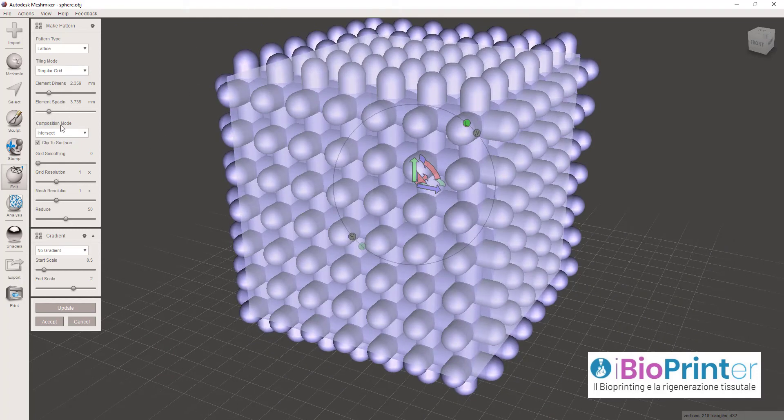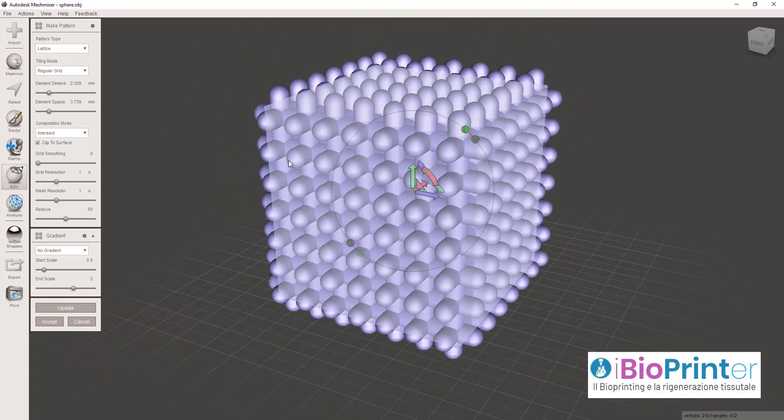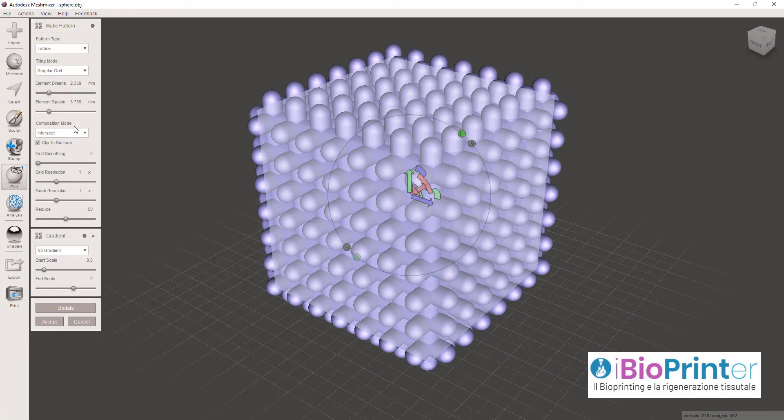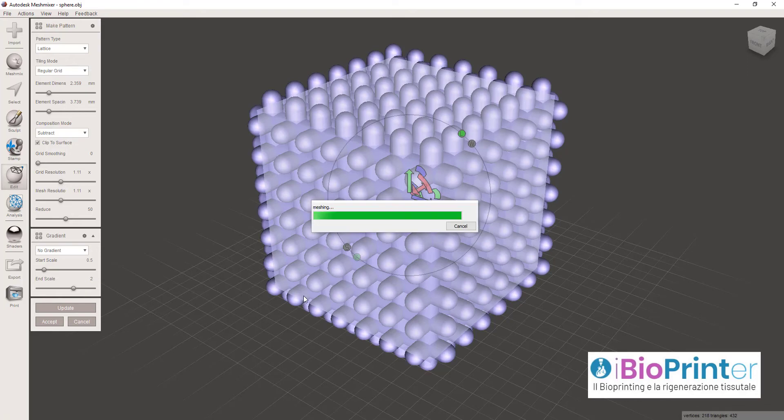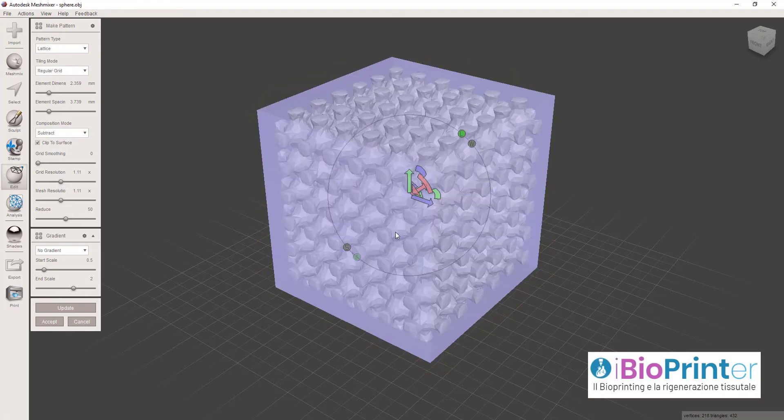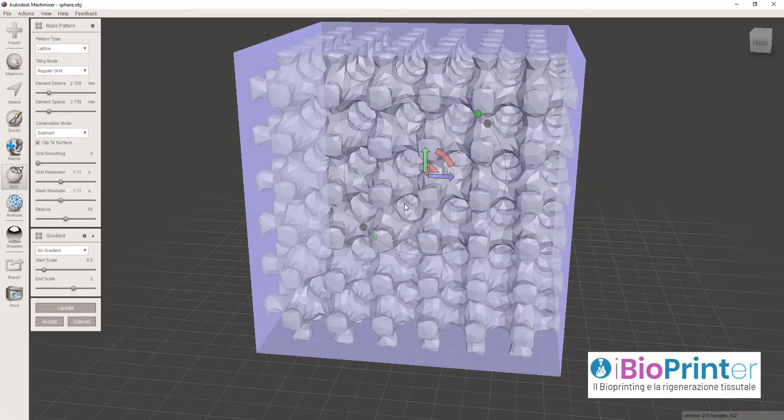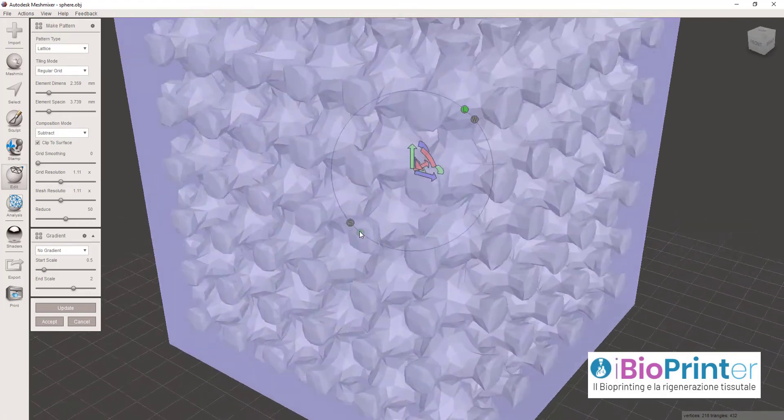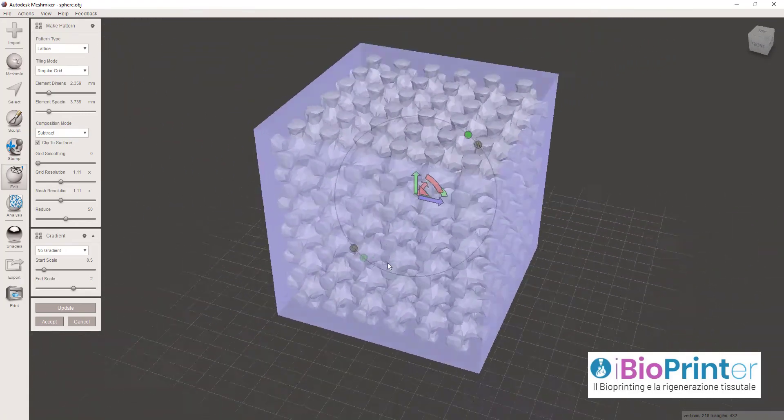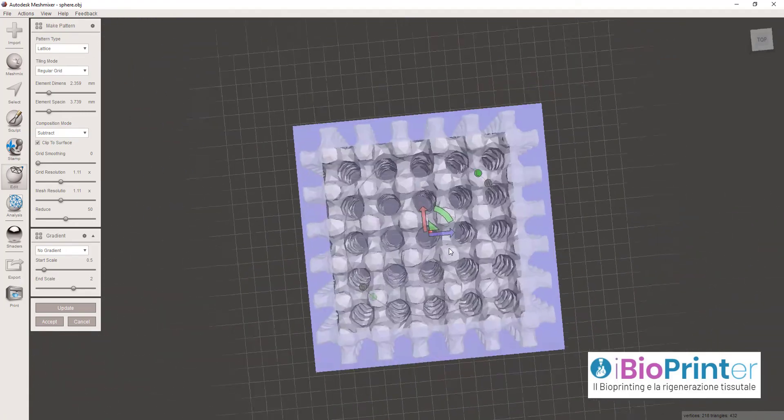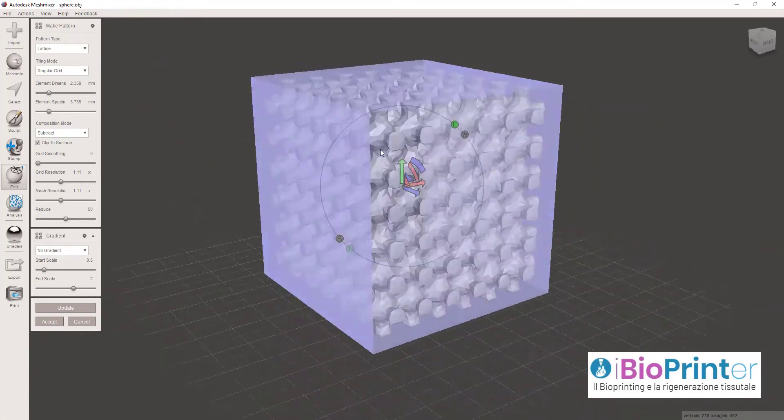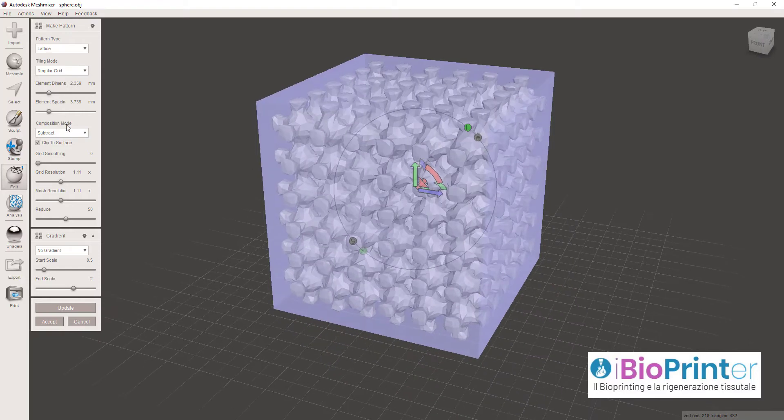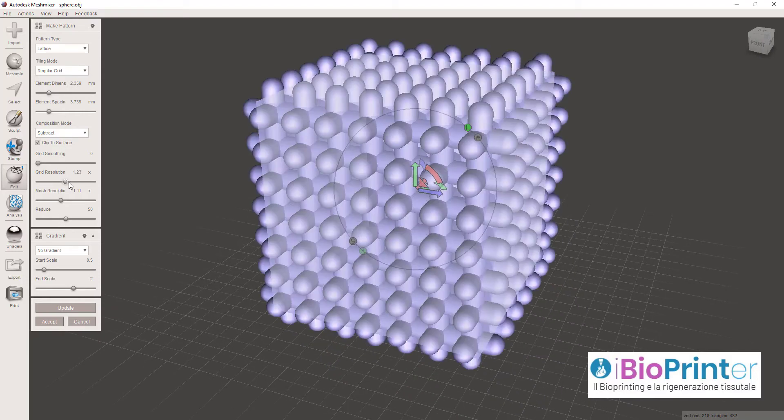Qui c'è scritto Composition Mode, che è un sistema di renderizzazione di questa struttura. Se io clicco su Subtract e clicco su Update, vedrò una struttura positiva, in evidenza, quello che ho visto precedentemente.